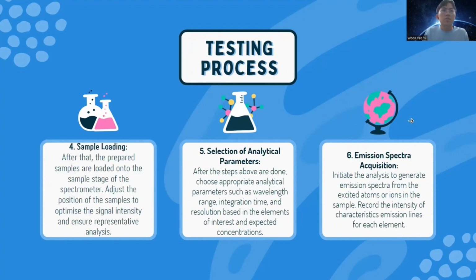Next one is the sample loading test. After the samples are loaded onto the sample stage of the spectrometer, the position of the samples is adjusted so that it can optimize the signal intensity and ensure representative analysis.